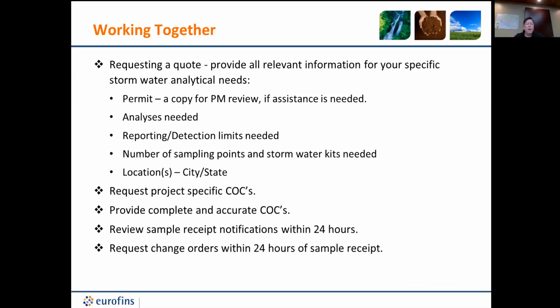But if you don't, make sure that when you provide us COCs, they are complete and accurate. And to help us out truly, review your sample receipt notifications within the 24 hours from when the project manager sends them to you. And if there are changes, get them to us as quickly as you can. That way we make sure we can still meet holding times, meet turnaround times on our end. So that's kind of an important thing for us.